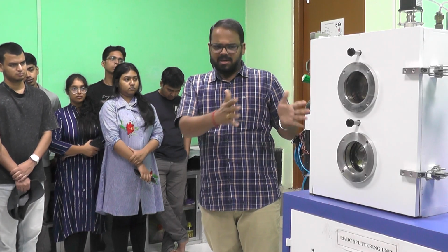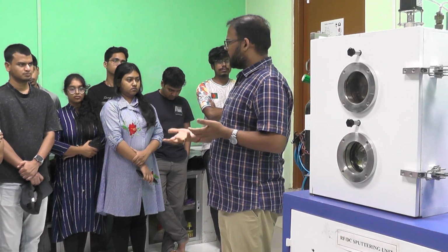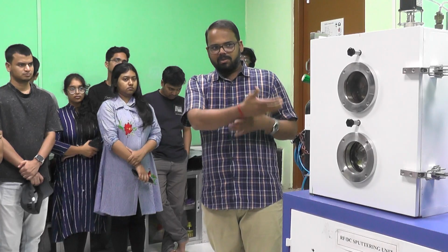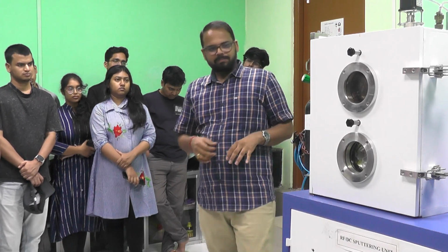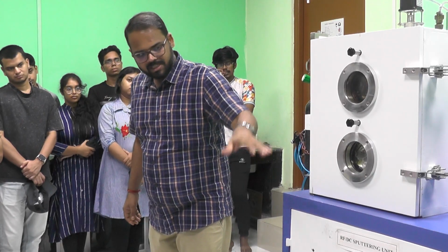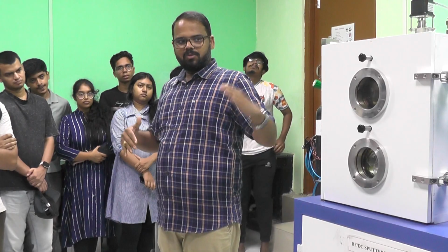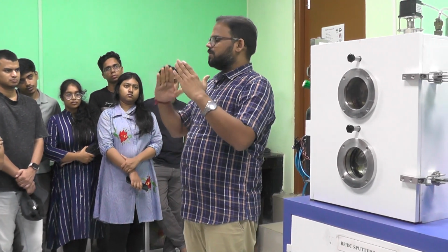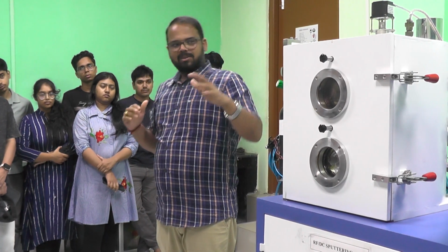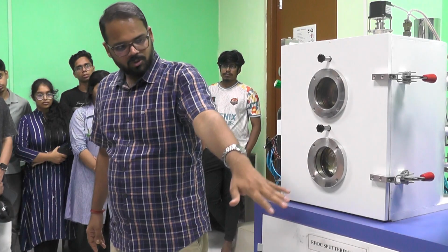So try to see this setup. There are multiple parts, and you can also see the thin films which we have drawn earlier here. You can check how the thin films are there, along with the parts. As I told you, we can co-sputter two materials. For that we have two different power sources, which means you need to provide two powers. So these are the power sources.